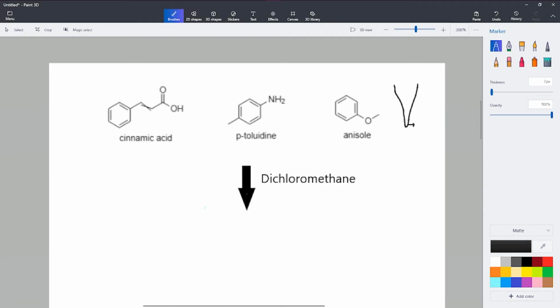So right now, we just put everything inside of dichloromethane. We're going to represent it with the color yellow. So everything is in here, right? Dichloromethane. Let's give that a yellow mark. Everything is being dissolved in there. We're just going to make it yellow.